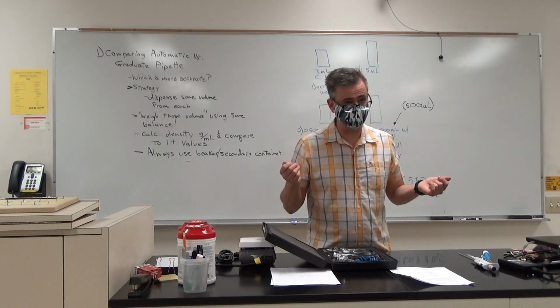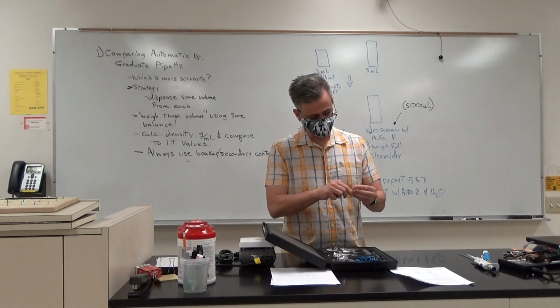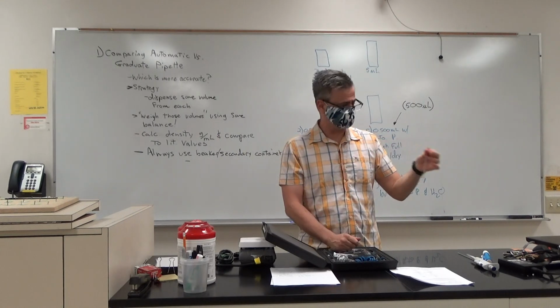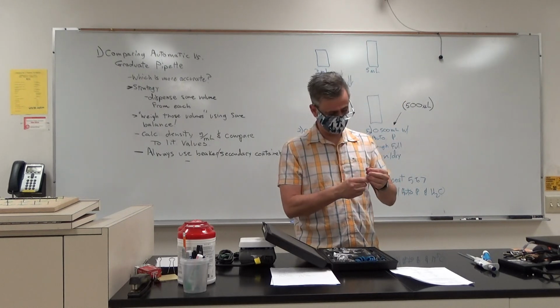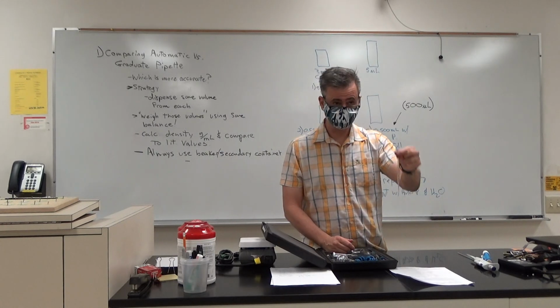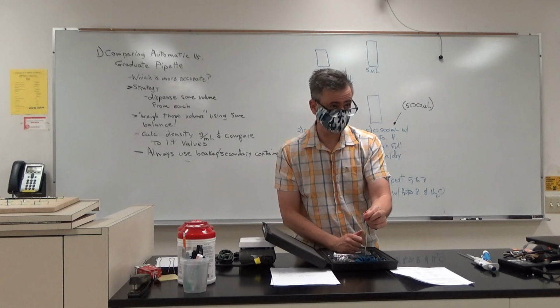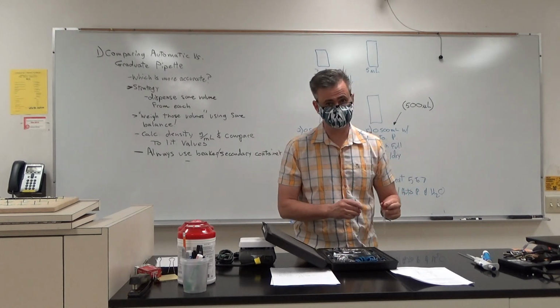You just need about 3 mil. 3.5 ain't gonna hurt you, 2.5 ain't gonna hurt you, okay? With these graduated pipettes, if you give it one squeeze, it depends on the type of bulb. So this is a 1 mil bulb, believe it or not. There are 2 mil bulbs. So I squeeze it, I put it down into the water, I suck up. I don't do this, because then it goes down into the bulb, all right? I keep it upright, and then I push out my liquid. Okay. Make sense? So, if I wanted 3 mils, boom, 3 mils, nice and fast, okay?